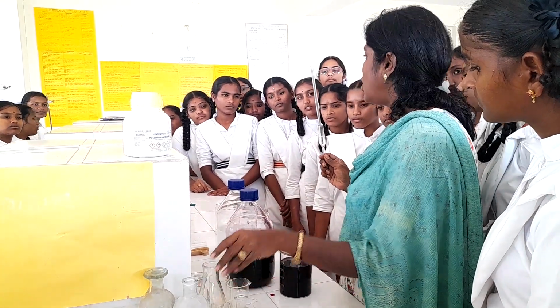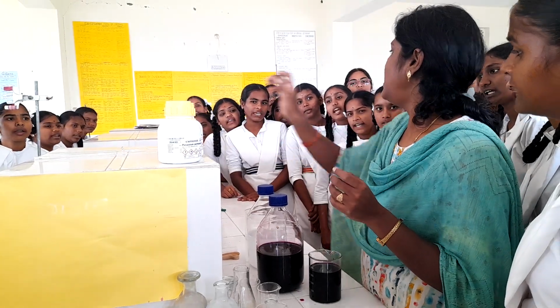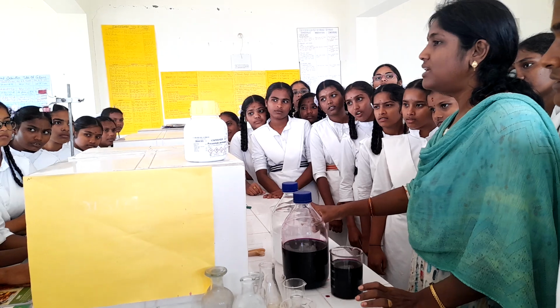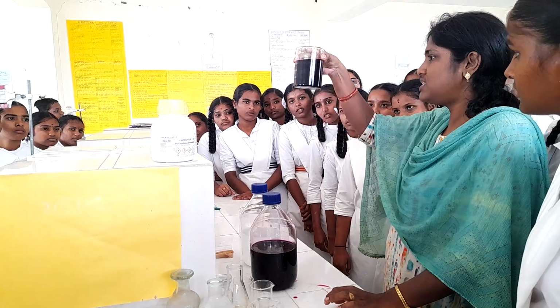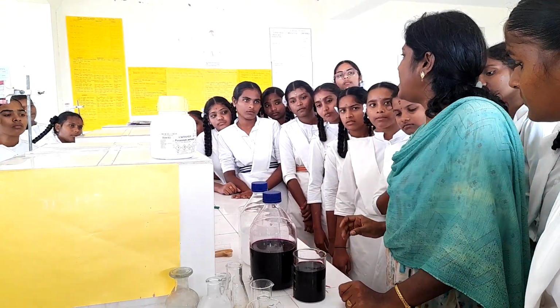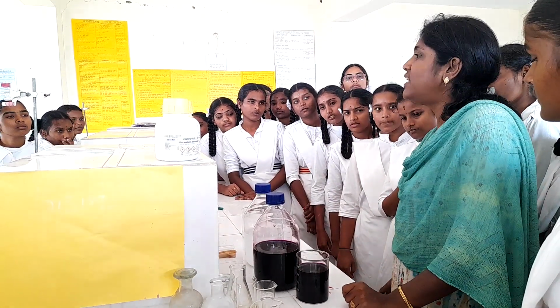And here we are not supposed to add any indicator. Can anyone tell me the reason? Itself it's an indicator. Yes, it is going to act as a self-indicator because it is already a colored solution. For a colored solution, there is no need to add any indicator. So it is going to act as a self-indicator.